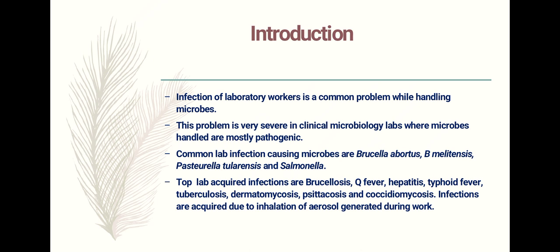The top lab-acquired infections are brucellosis, Q fever, hepatitis, typhoid fever, tuberculosis, dermatomycosis, psittacosis, and coccidioidomycosis. All these infections occur due to inhalation of aerosol that is generated during the work.